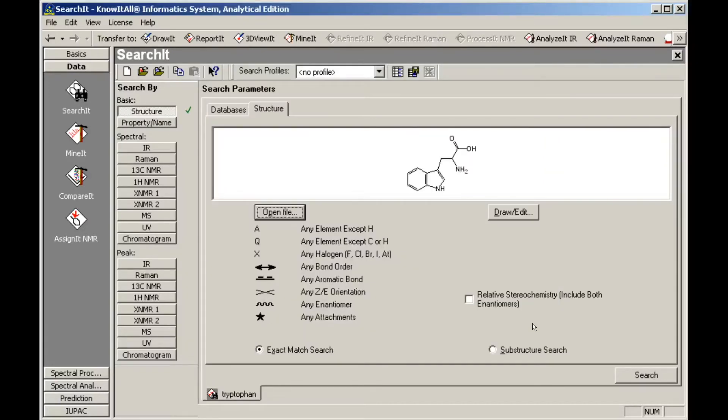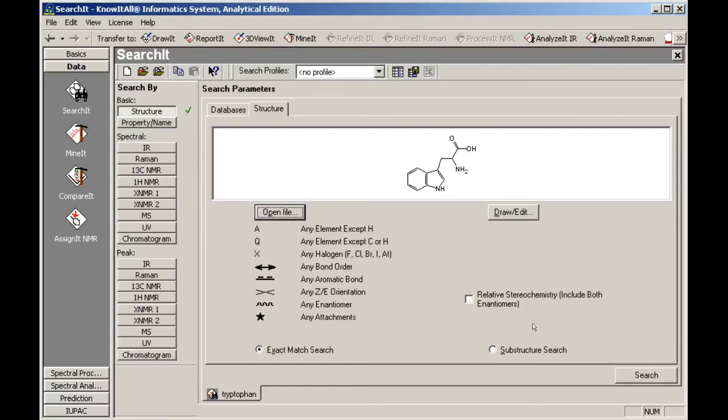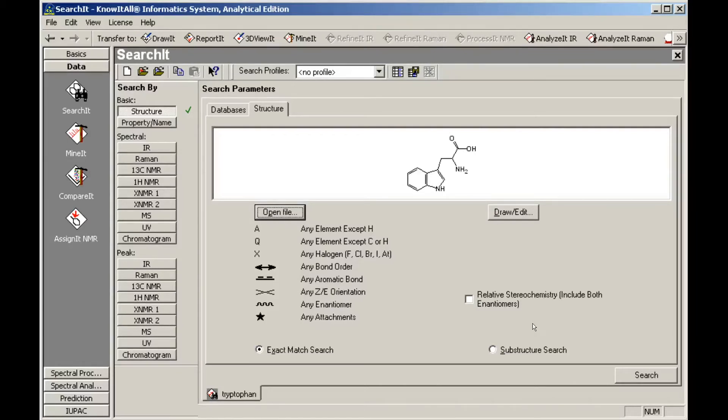Note that the red X has been replaced with a green check mark, and the search button is now available. Both exact match and substructure searches can be performed, and results can include stereochemical variants if desired. We'll start by performing an exact match search.